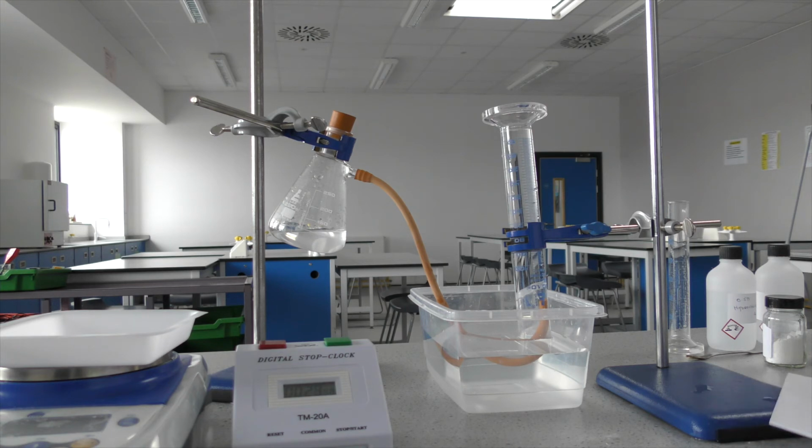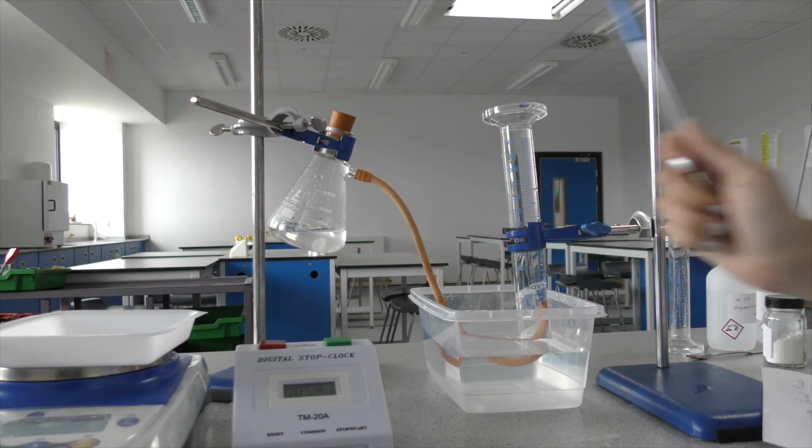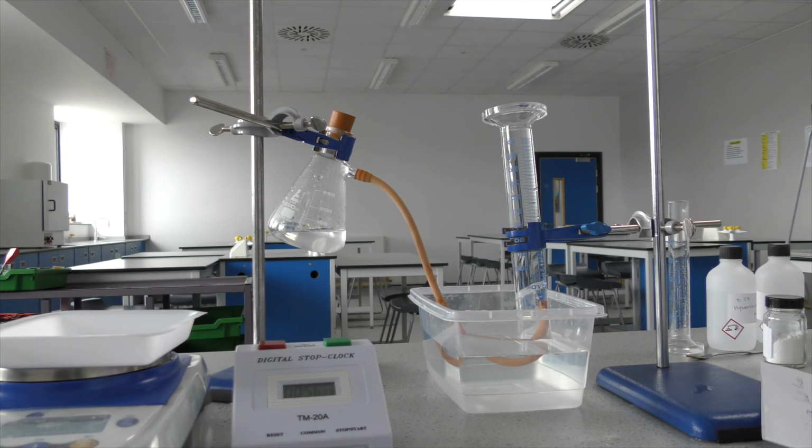30 seconds has now passed, 0. You can see the gas being released here, you can see the bubbles coming up, just not enough yet to have displaced any of our water.